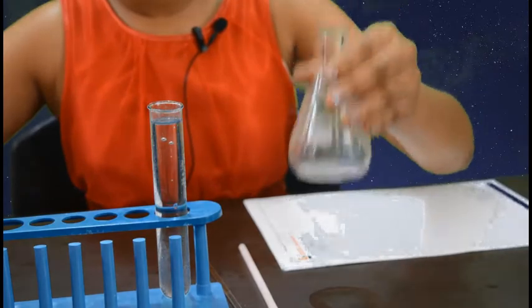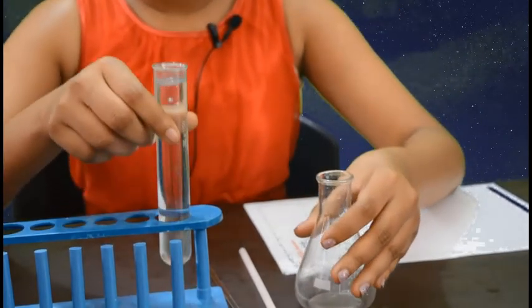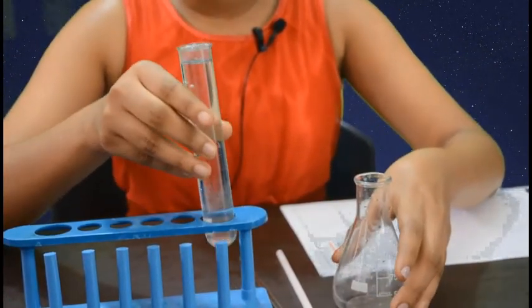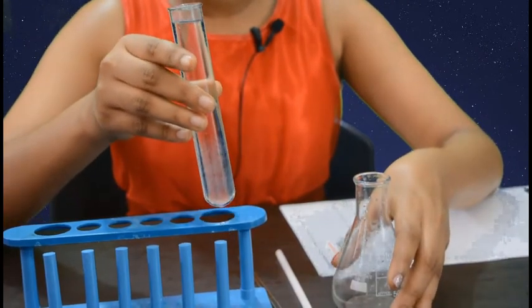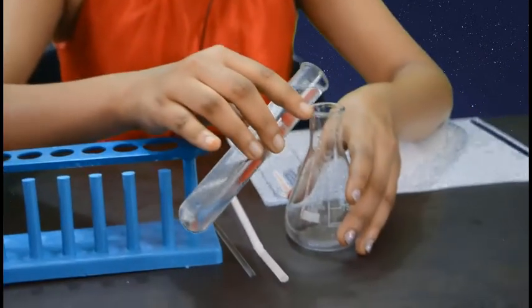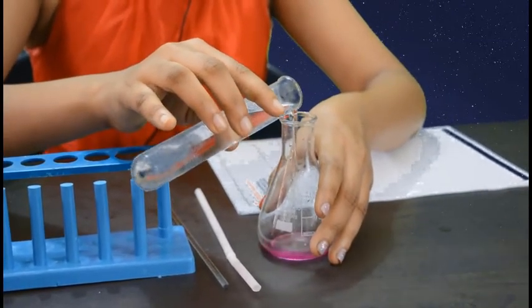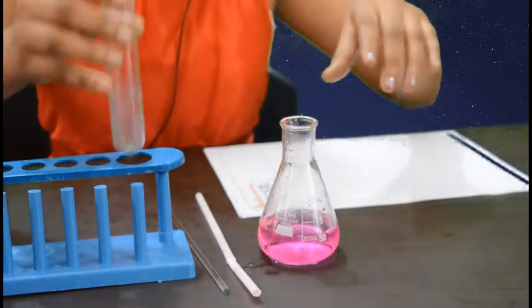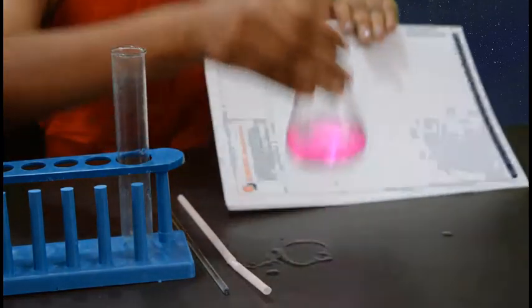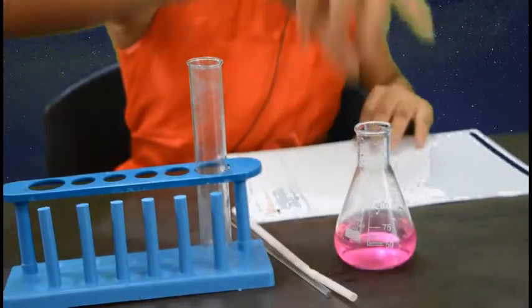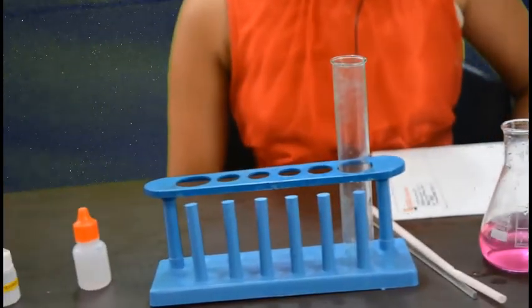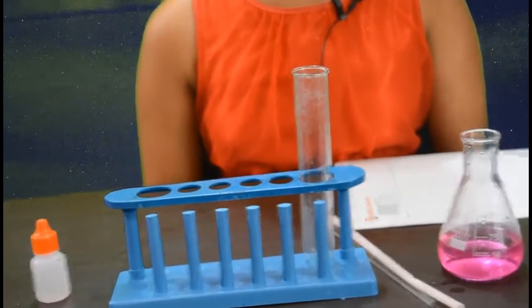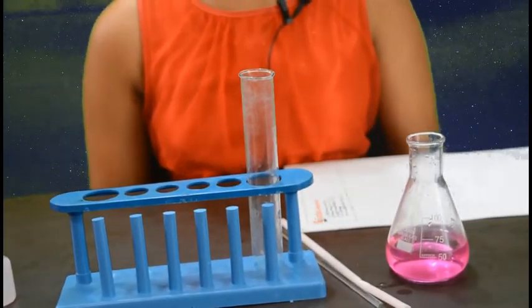This is basic in nature and this is phenophthalein solution. Now let's add phenophthalein solution into sodium carbonate. It turns pink in color. This is because the phenophthalein has been mixed with sodium carbonate, and it turns pink in color because sodium carbonate is basic in nature.